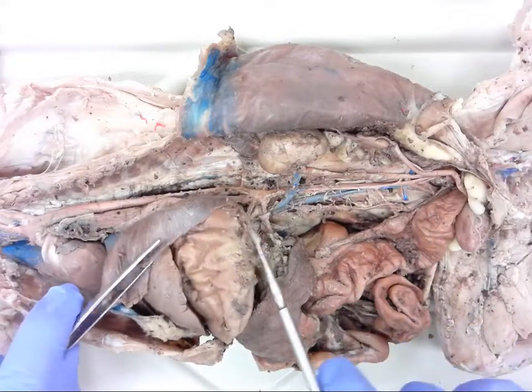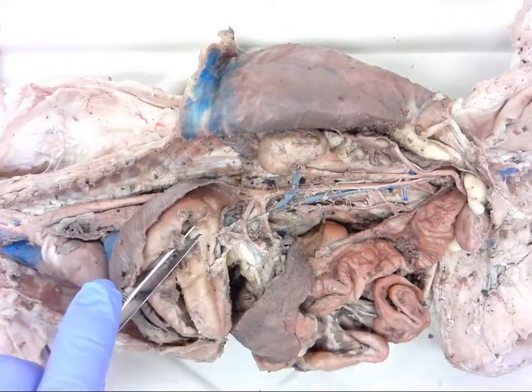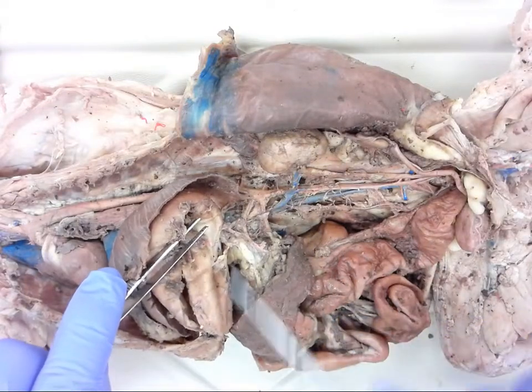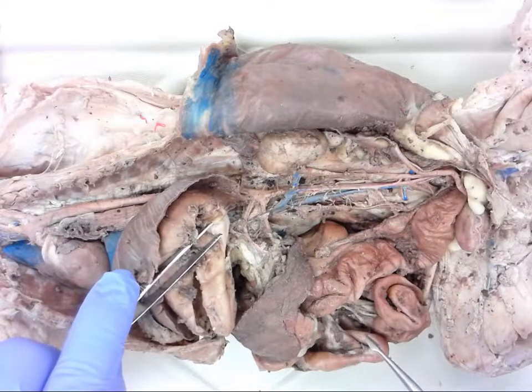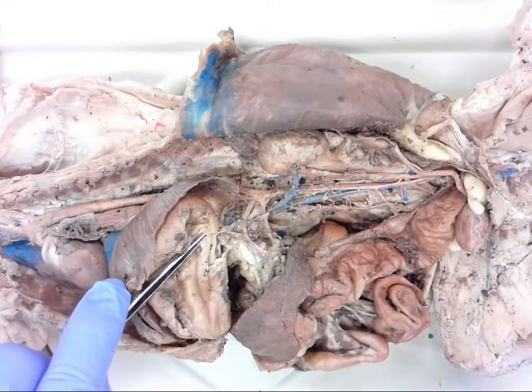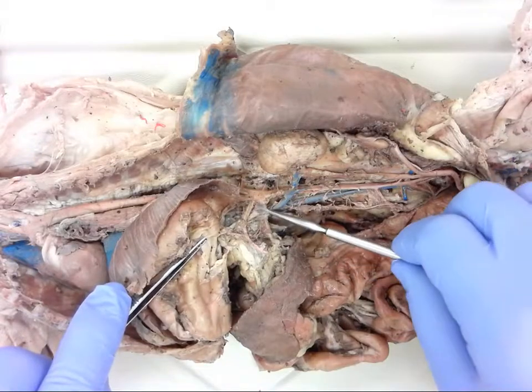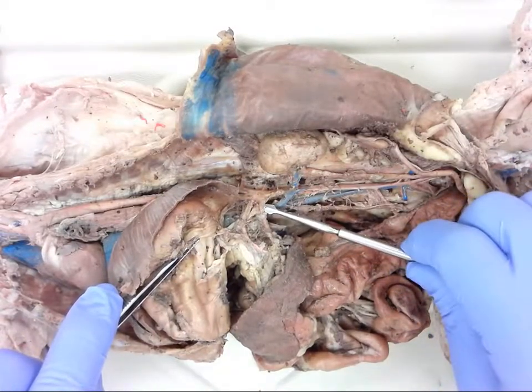As you go through the abdominal area, you're going to find a lot of branches. This is going to supply blood flow to all of the abdominal contents, all the major organs. So your first branch is going to be the celiac trunk. It comes off of right here. There's another branch below it. We'll get to that in a moment.